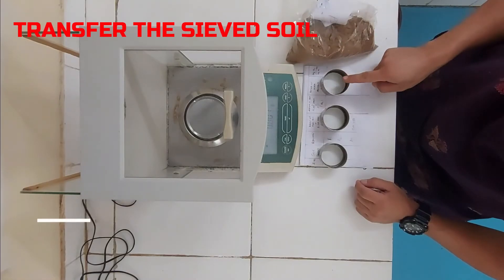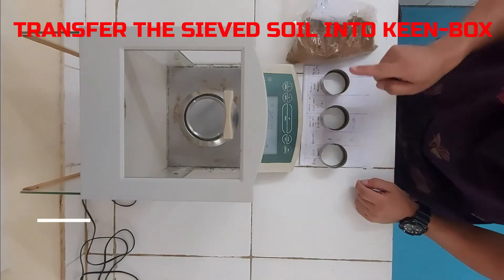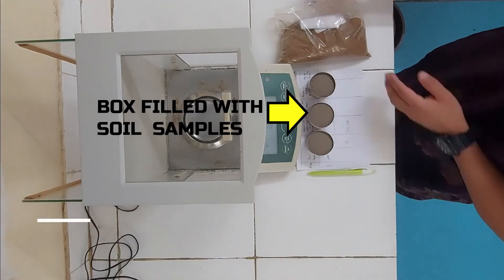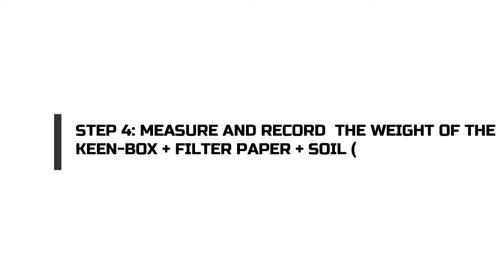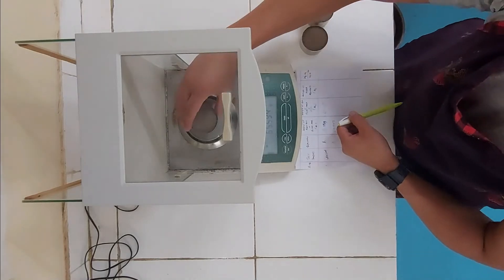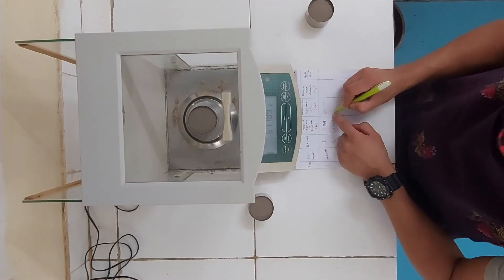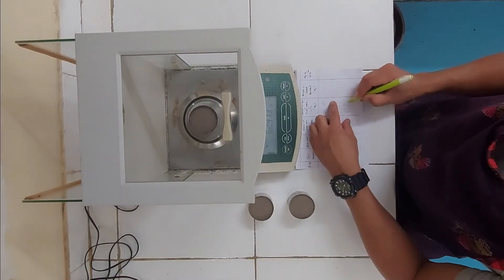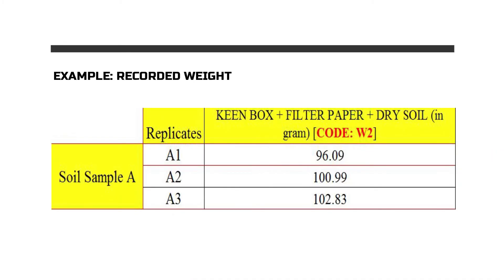Next, transfer the sieved soil samples into the Keen Box and fill it with the sieved soil. Then again record the weight of the Keen Box plus the filter paper plus the soil, and let this weight of the Keen Box, filter paper, and dry soil be coded as W2.